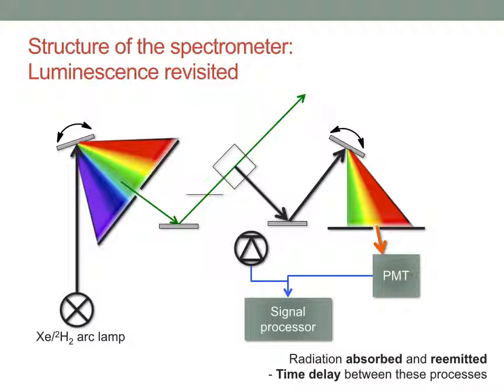I'm going to look at scattered light. I'm going to look at light coming out at 90 degrees from my sample, just like I would in a fluorimeter. And I'm going to have something to select wavelength, particularly on the emission. This is where we would see it in a traditional Raman, and that goes to a PMT. PMTs because they're incredibly sensitive. So Raman's a very low signal option, and so I need a very sensitive detector.